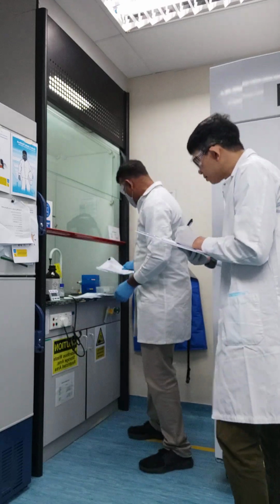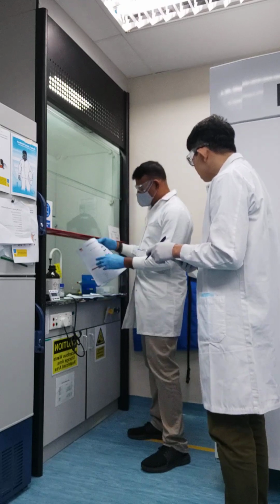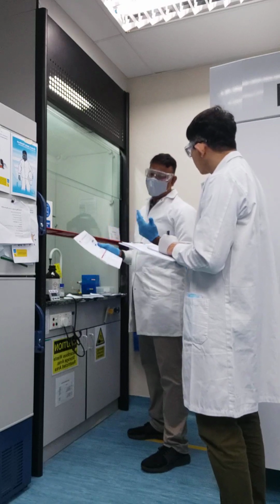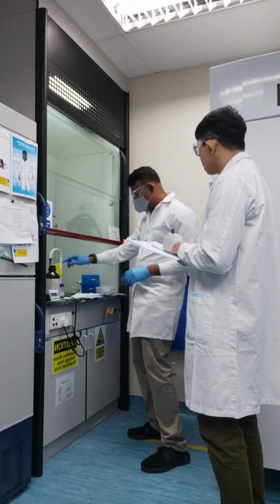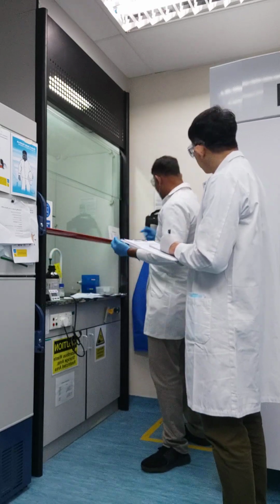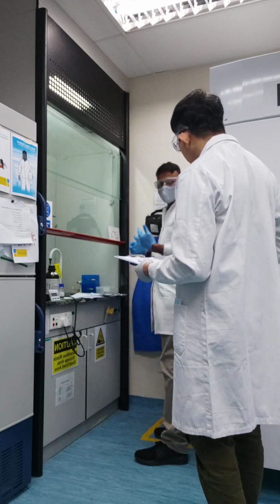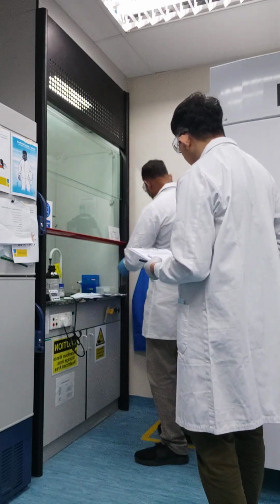The next step is to protect ourselves before conducting this experiment by having the appropriate exposure controls, which is personal protective equipment. For this particular chemical, we are following the MSDS information. I will put on the personal protective equipment. You can observe me doing it, and later on you can do it as well.